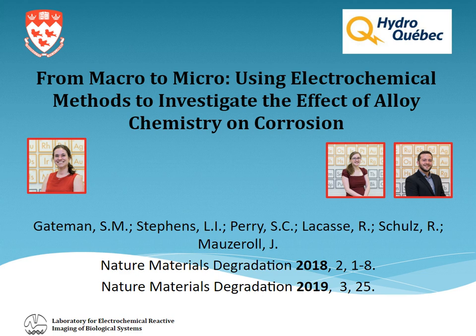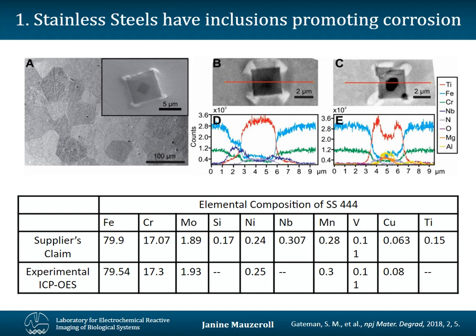They had almost no porosity. All right, so now switching gears for my third story, it's to demonstrate how SECM can be used in the corrosion field. Now, if you've ever worked in the corrosion field, you know that alloys cannot be considered as uniform substrates, just like a piece of platinum or gold.